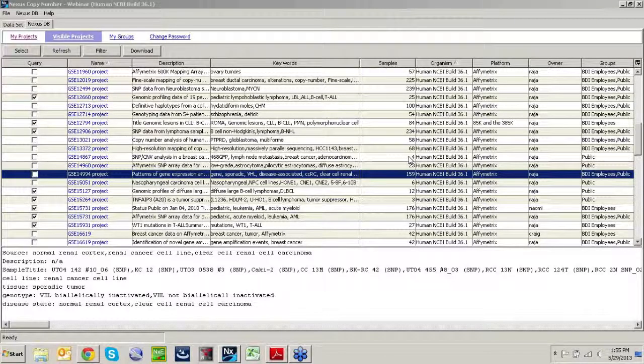Another question here, can we use Nexus for methylation analysis? Yes, so right now I'm showing you the standard edition, which does not contain any additional modules, but you do have the ability to add on other modules, so we can also look at methylation and expression. Those are different add-ons, and if you look at our website, biodiscovery.com, and click on copy number software and view differences, you can actually see the different modules that you can add in, and it will also explain in detail which module will be of interest for you. There is one for methylation analysis as well.